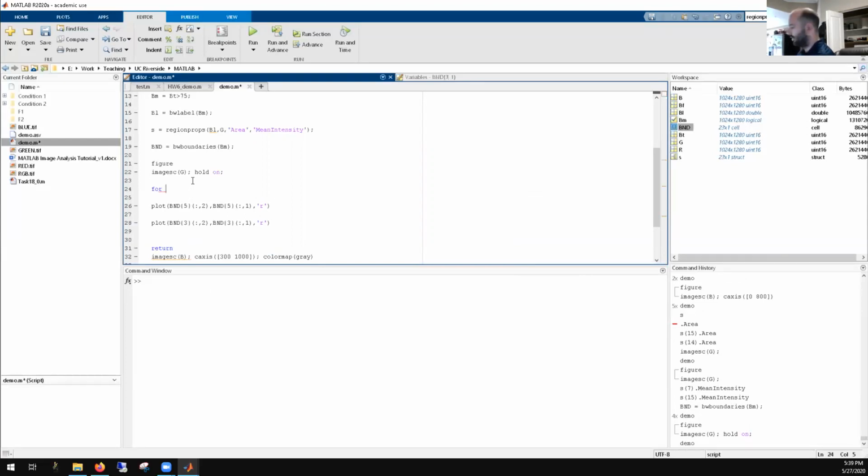So I'm going to create a for loop, and I'm going to create an index. I'm not going to call it I because I don't want people stuck in the concept that they have to call it I. I'm going to create a vector that's 1, 2, 3, and 15. Oh, I shouldn't use cell, that's messy. I'm going to use C. I apologize for the confusion. This is my looping variable C, and C is going to have 4 values: 1, 2, 3, and 15.